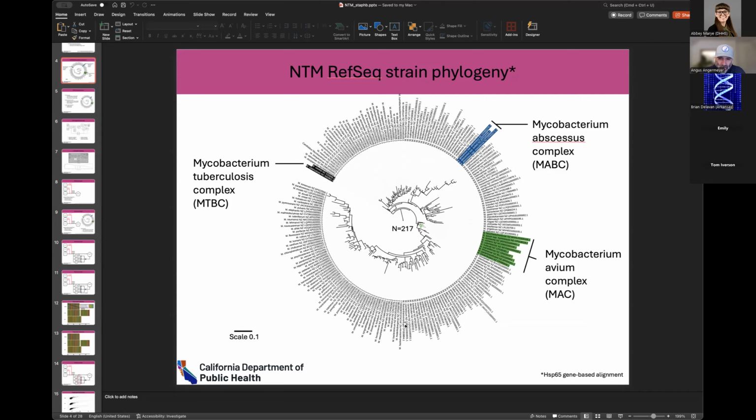The main thrust of this pipeline is that 99% of the time I'm going to be getting enough sequence data of a high enough quality just to do a whole genome sequence analysis. ANI, very simple, done. But using these three marker genes gives us a little bit of backwards compatibility with historical records, and a little bit more discriminatory power in cases where there's some confusion.